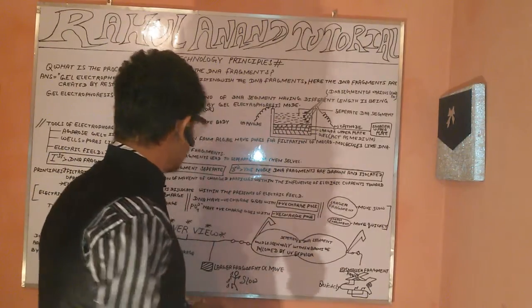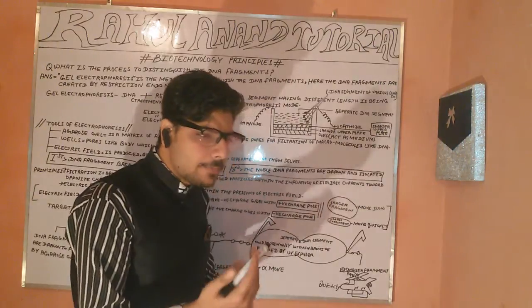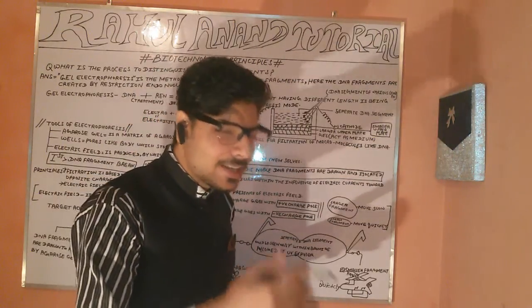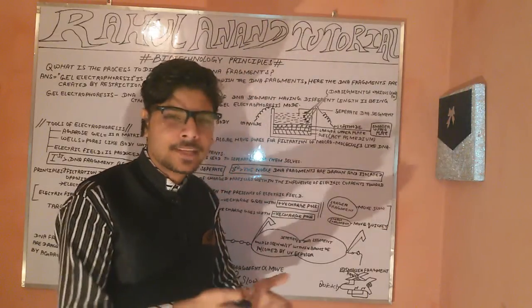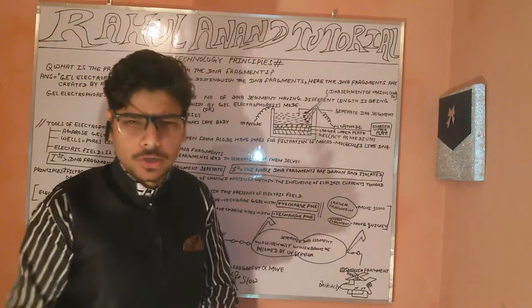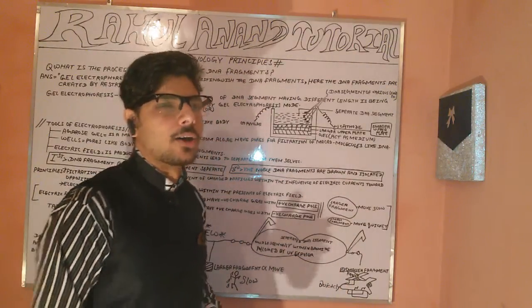So agarose. These have a matrix-like structure. These are extracted from the alga, playing an important role for cultivating and demonstrating, to separate as well as to filter the macromolecules, regarding our deoxyribonucleic acid.